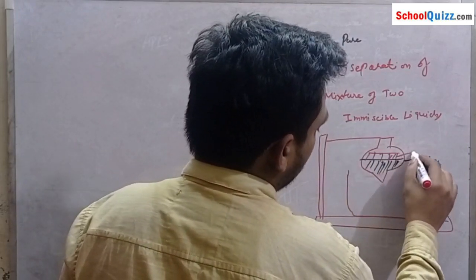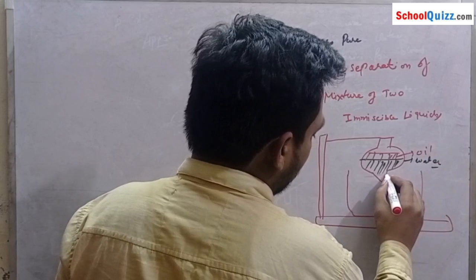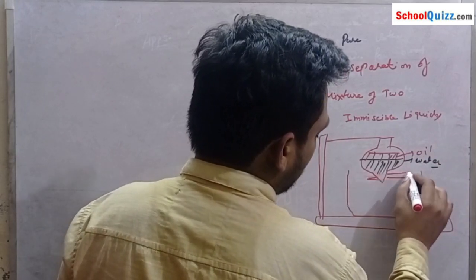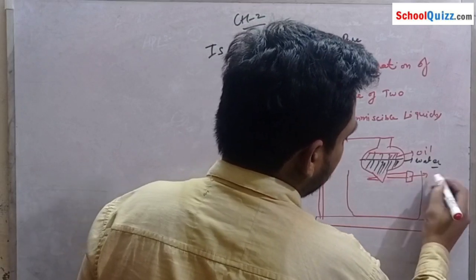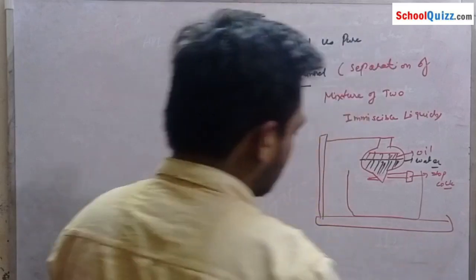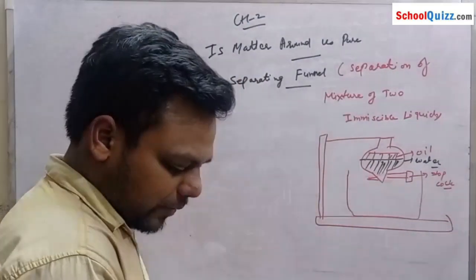Here the stopcock is present, and this is our beaker.